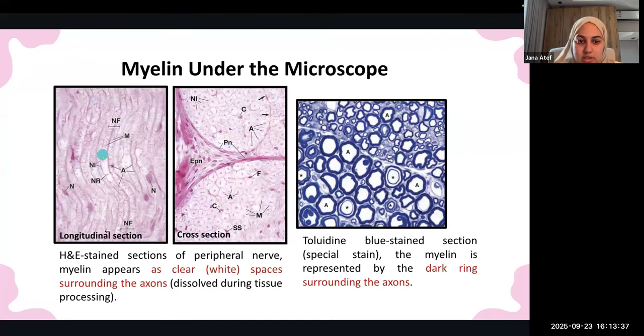So this is a longitudinal section. This is a cross section. Okay. It's very easy. You get a cross section, you cut this one in half, you look at it from here. I don't want to spill water, but it's gonna look like a round hole. If you cut it this way, it's gonna look longitudinal. Okay, so longitudinal cut and cross sectional cut.